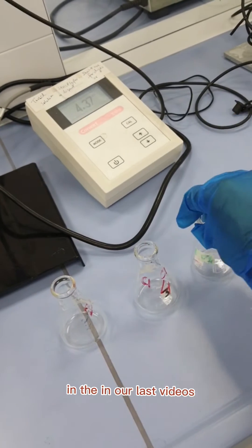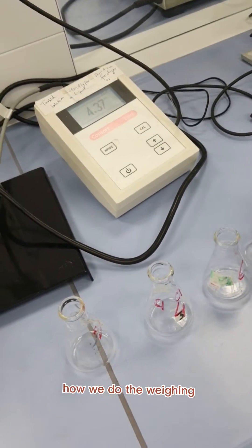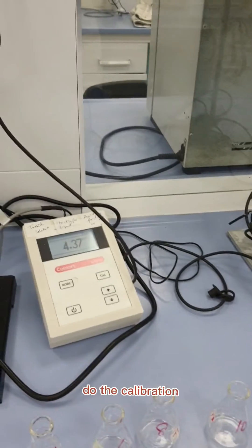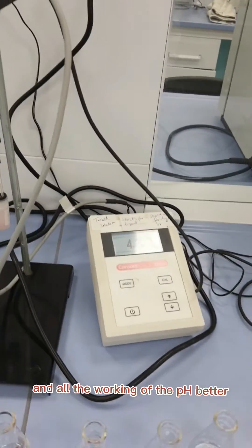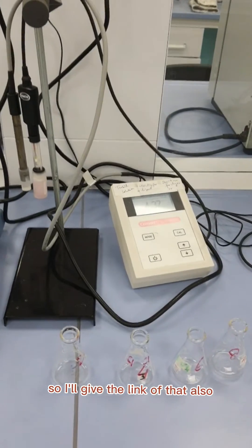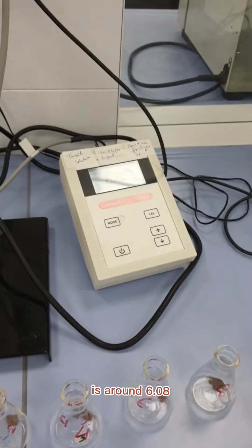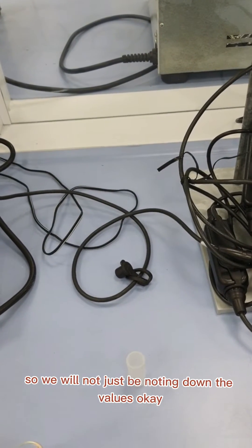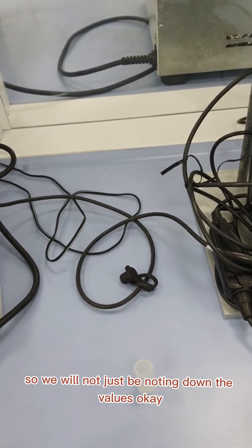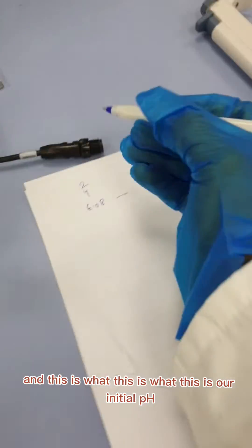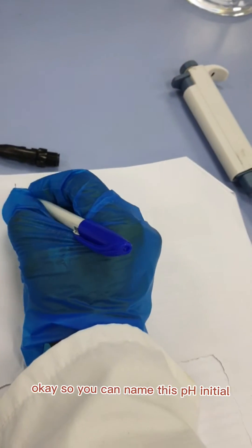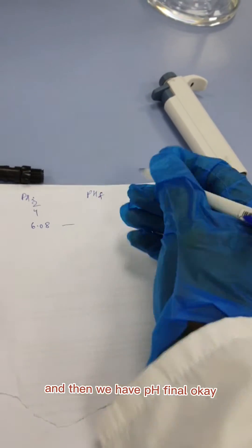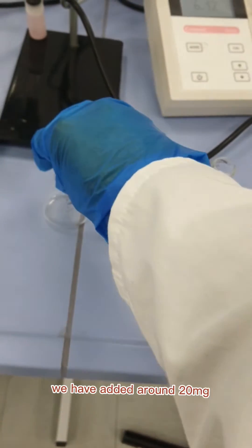You can see here the pH after the solution is around 6.08. So we will note down the values. This is our initial pH. You can name this pH initial and then we have pH final. Already we have added around 20 milligrams in all the cases.